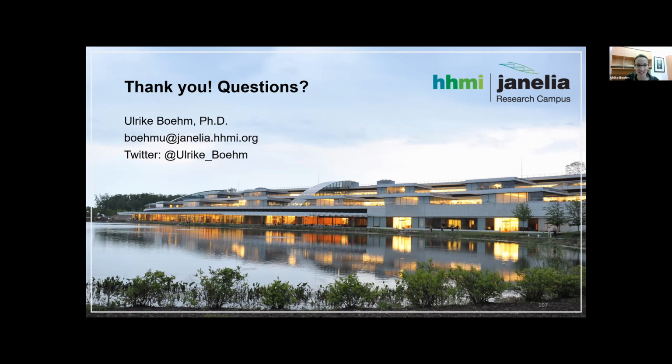So that's quite impressive. But I also have to say that then you distribute the signal over a very wide range. So when you image one plane, you might be able to image a very thick sandwich, but it might be better in terms of photon efficiency, and that's something other groups do, to have an asymmetric point spread function over a smaller range, but then stack these ranges.